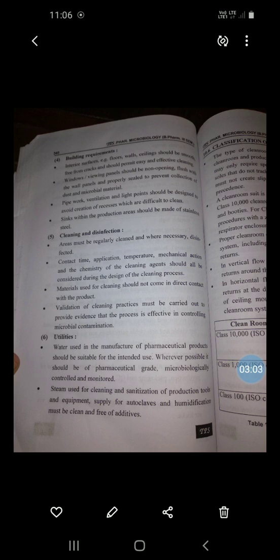Next, cleaning and disinfection. The area must be regularly cleaned and, where necessary, disinfected.